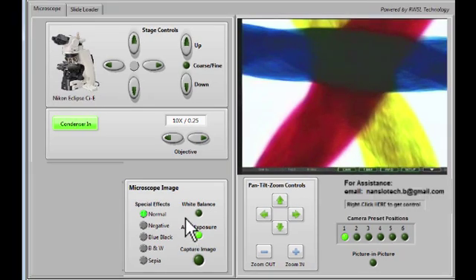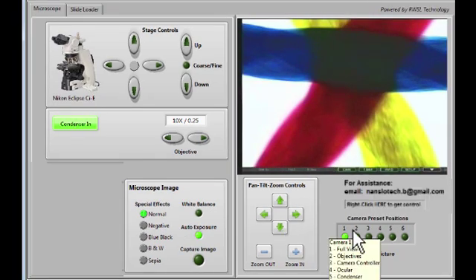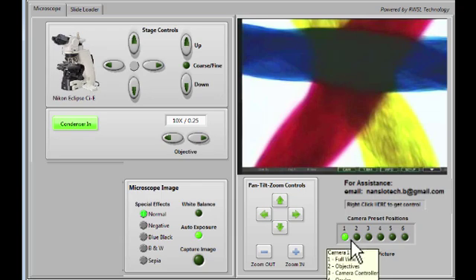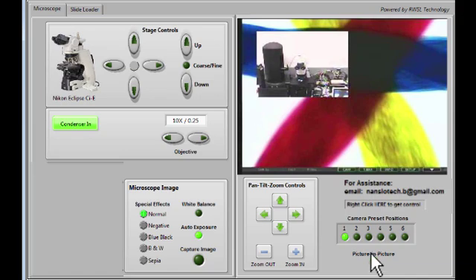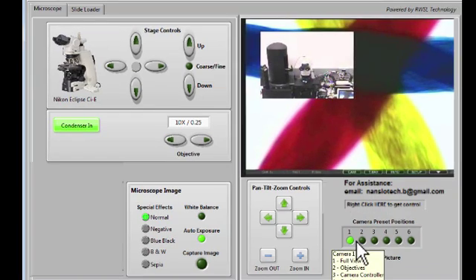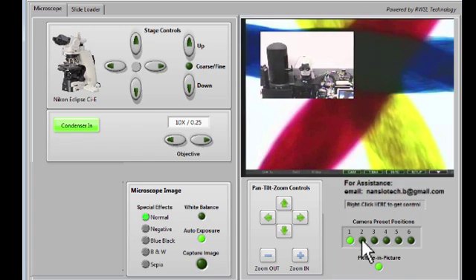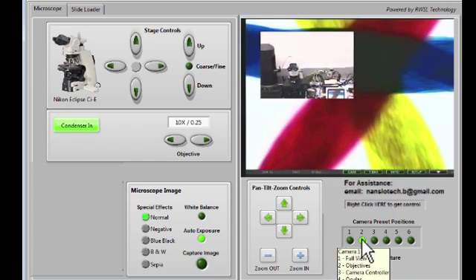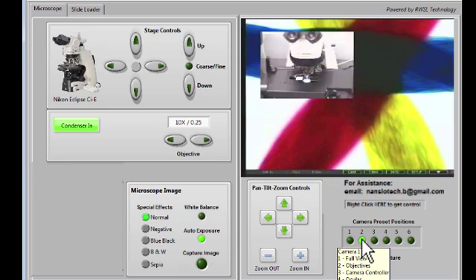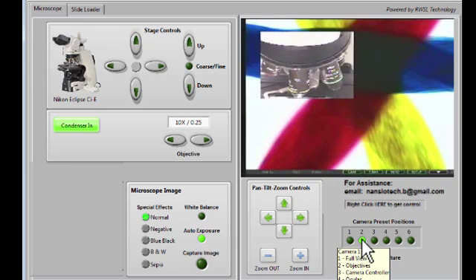When you're finished viewing the high-resolution image and have saved it, you can close the window. Going back to the picture-in-picture camera, if we turn it on, we can see what's happening in the lab in real time. Hovering over the preset position buttons will show you what each of the presets is set to. For example, we can click on preset 2 to zoom in on the objectives.